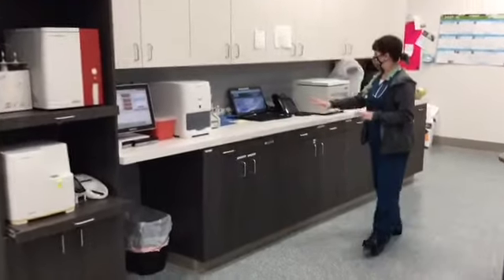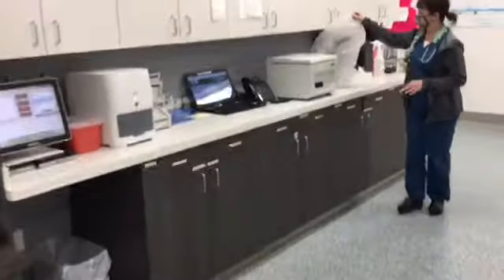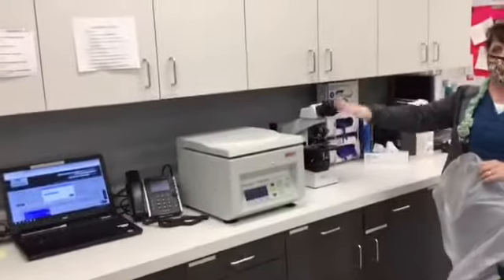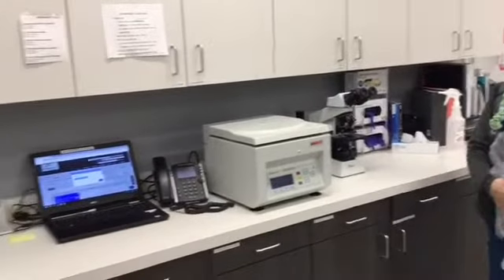So all these instruments here, I have a microscope here that we use as well. So again, all this stuff here is laboratory work that we do tests in the hospital.